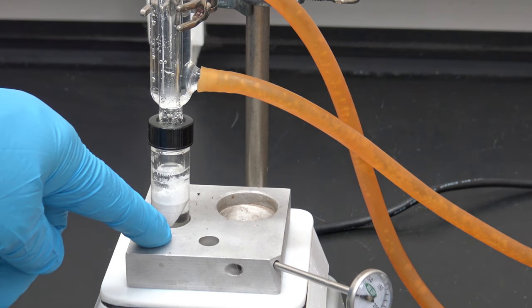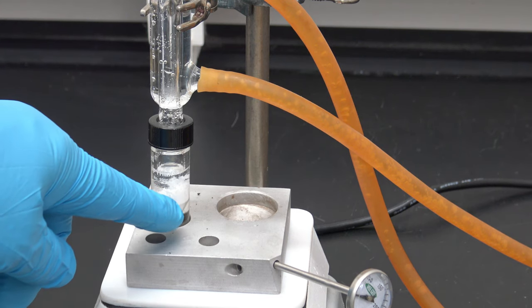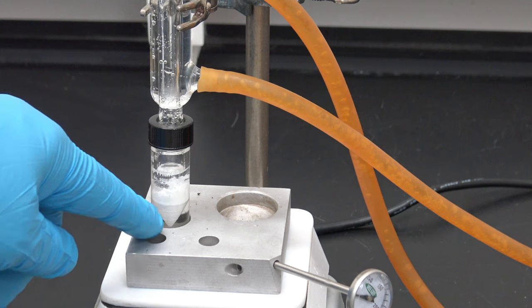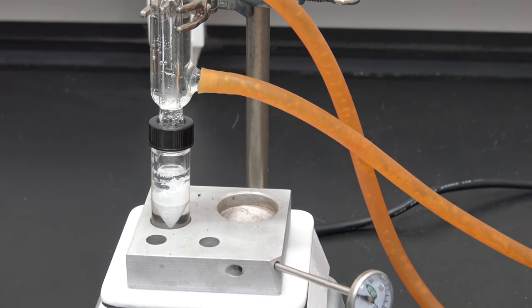The reason I set it at 300 degrees is that there's thermal loss between the hot plate and the thermal mass here, and then there's thermal loss again. So I need to get up to about 300 degrees to get the aqueous sodium hydroxide up to 100 degrees C so that it will start to boil. It's going to take about 10 to 15 minutes for that hot plate to get up to temperature. So I'm going to pause the video for a short while and then turn it back on when we're ready to reflux.